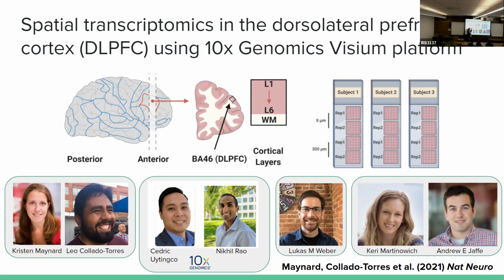So this is what they call a slab. Lay that slab flat. Now zoom into just this tiny little square here, and this is the only thing that actually gets sequenced. In this particular area, it's a very well studied area in the human brain called the dorsolateral prefrontal cortex, DLPFC. We know that it has 6 very well-known morphological layers and then white matter. So you can see the white matter here, and these are the 6 layers that we wanted to start with.